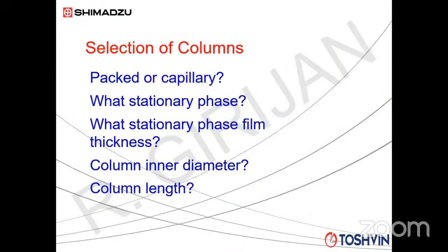Okay. Now, the most critical part in chromatography, whether you are talking about an HPLC system or a GC system, I normally consider the column the most important part of this equipment, because the column is ultimately giving you the separation. The desired separation is given by the column, not by the injection mechanism, not by the detection mechanism, not by the software, nothing. The column is responsible for giving the desired separation. So column selection is extremely critical in chromatography. Unless you select the right type of column, you will not get the right type of separation.